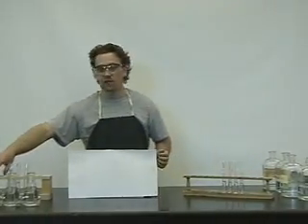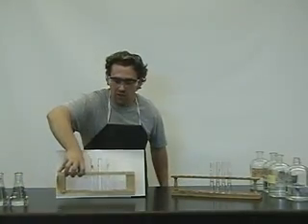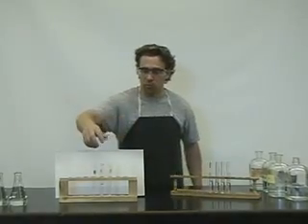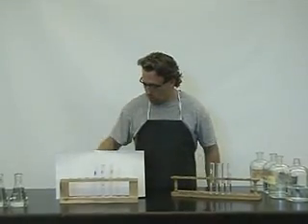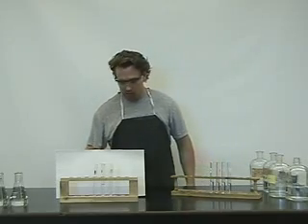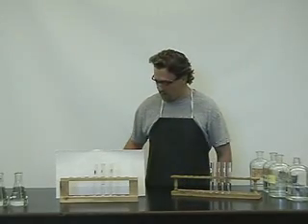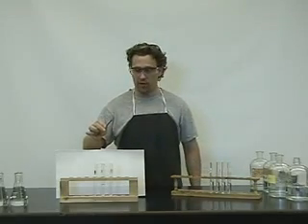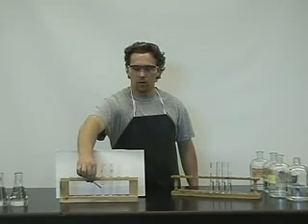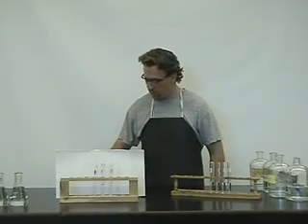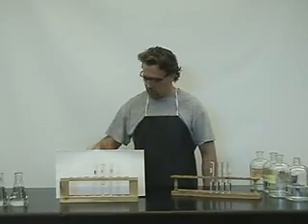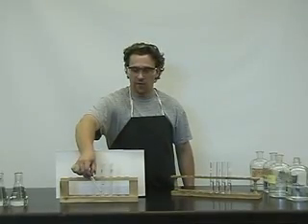In part two we are going to study the effect of surface area on the rate of reaction. We have prepared three solutions of hydrochloric acid, each being 1 molar. We have taken one piece of magnesium and left it as is, a one centimeter strip. One strip we have rolled up into a small ball. And thirdly, we have taken the last strip and cut it up into slivers.